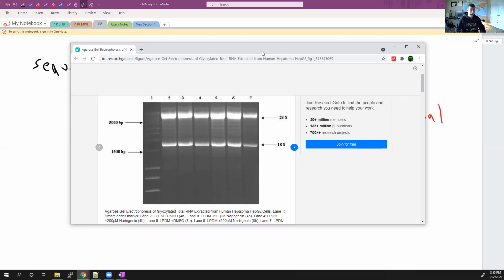Now I have done this step. I have worked with RNA up to this point, but once I get the RNA out of a cell, I give it to somebody else who can do the wizardry that I can't perform. But if we're looking at this, we at least recognize electrophoresis, right? Anything that glows is going to be our molecule of interest. We have a ladder over here that describes how big these molecules are, and the brighter the glow, the more of that molecule is present.